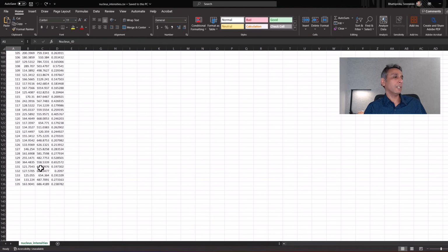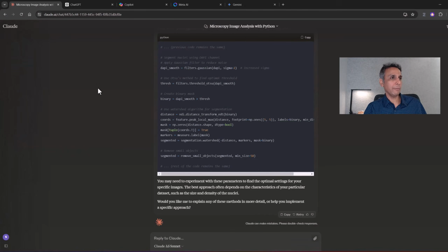Again, this is, oh, that's pretty good, 135. I know I have about 115-ish depending on who segments it manually. So I'm super impressed with Claude. It actually gave me what I wanted, right? None of the other ones actually gave me anything. ChatGPT seems to be heading in the right direction.